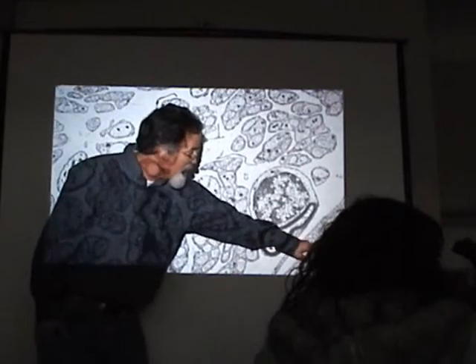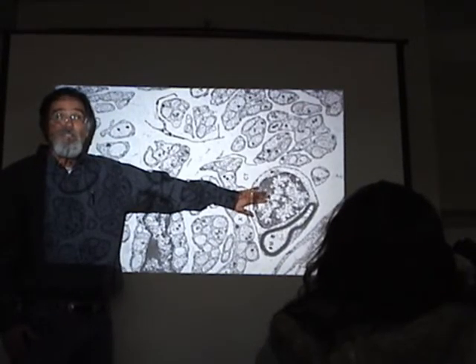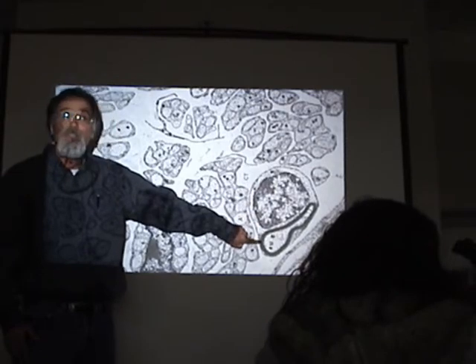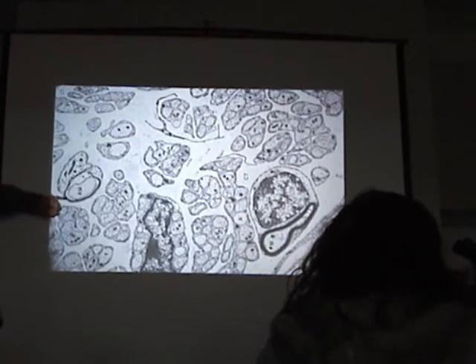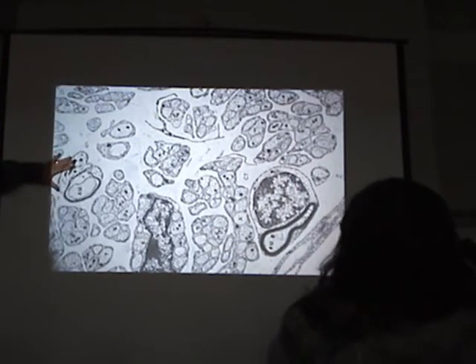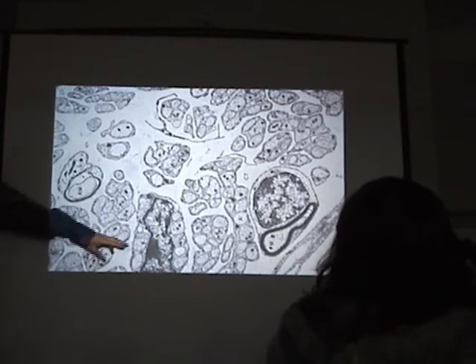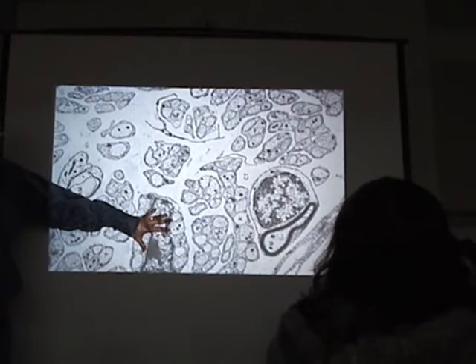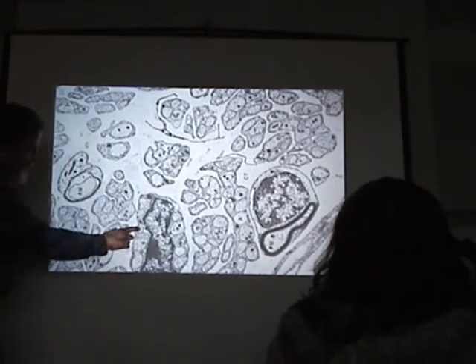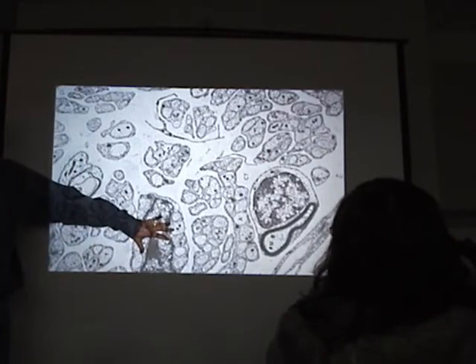we see a little bit of perineurium here. We see this nucleated structure, which is the nucleus of the Schwann cell that's elaborating this myelin sheath, okay? Over here we can see another myelinated fiber. We don't see the nucleus in this profile, okay? These structures here represent unmyelinated fibers. Here we can see the nucleus of a Schwann cell, and this unmyelinated fiber has 10 axons that I can see.